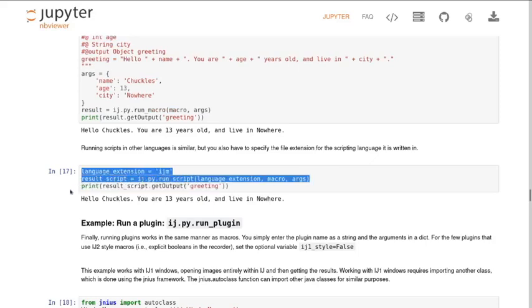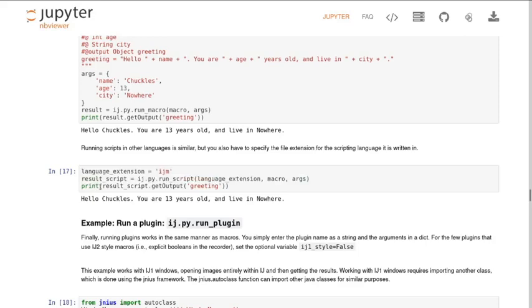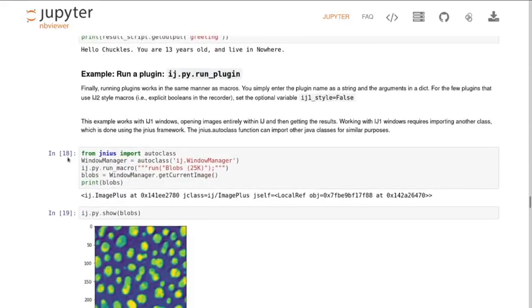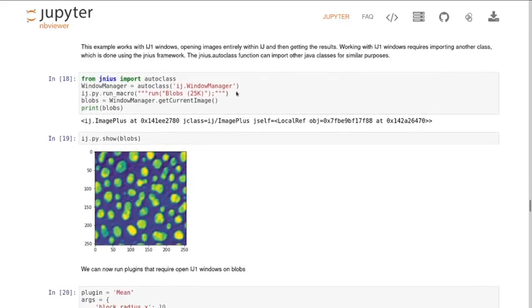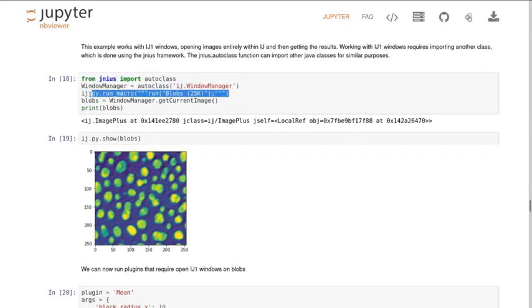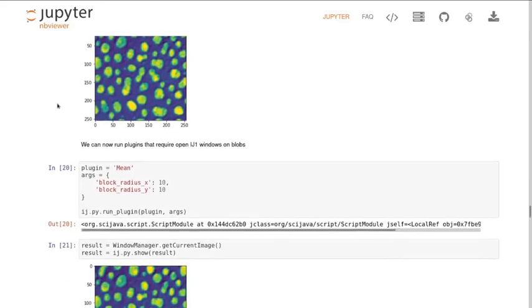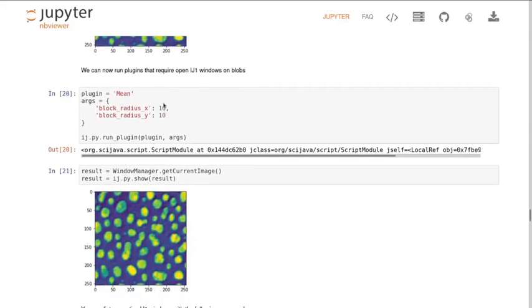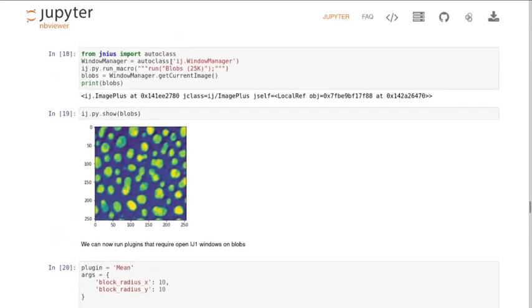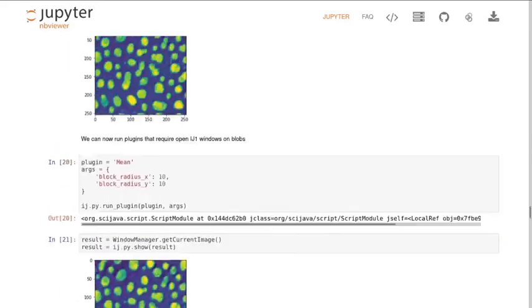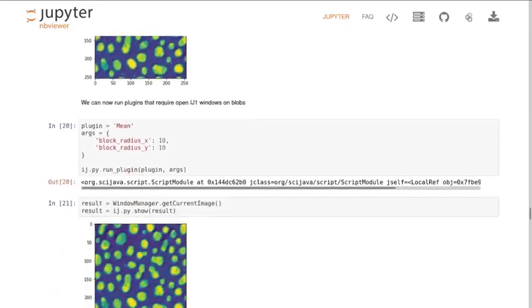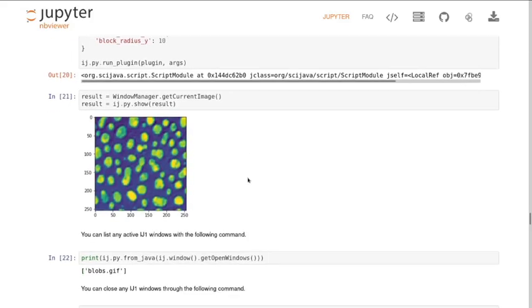You can also run plugins. So in theory, you can run any plugin that's in that version of ImageJ that you've initialized. So this one actually runs the macro to get the blog image. It gets that image, shows it. It then apparently does a mean. However, this is a square mean. It should be a square mean of 10 by 10. And if you look at this image and this image, you'll notice they're actually identical. So that tutorial is slightly broken and not actually showing what it should do. I will, in a second, show you a bit more GitHub where I created what's called a GitHub issue to tell them that that was broken. And we'll talk about how you can use those to interact with development teams for these sorts of projects.